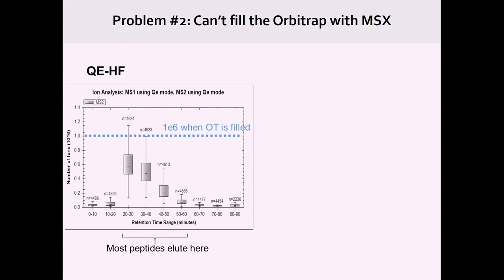Now, there are some problems with this. If you're measuring five 4 mass-to-charge wide windows, or let's make the math a little bit simpler, 4 or 5 mass-to-charge wide windows, and let's say you had 60 milliseconds as a maximum inject time in order to keep the mass analyzer going at a given rate, that basically means that you can't fill any one of the windows for more than about 15 milliseconds.